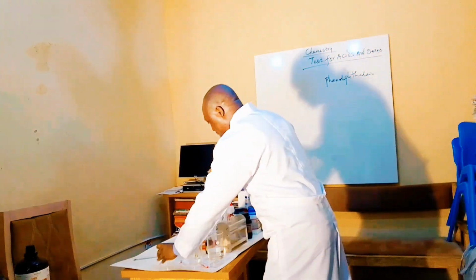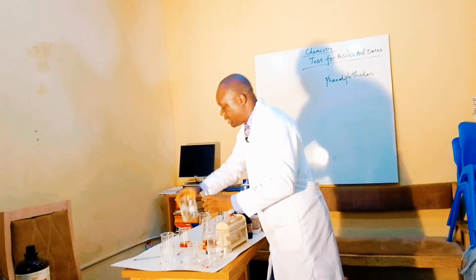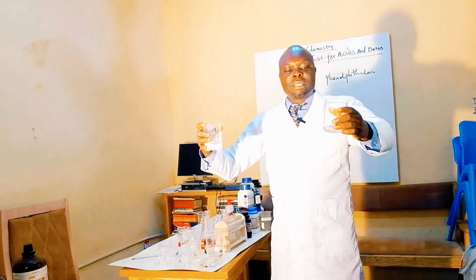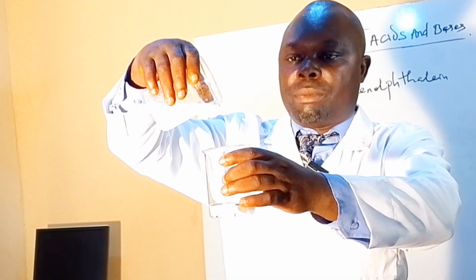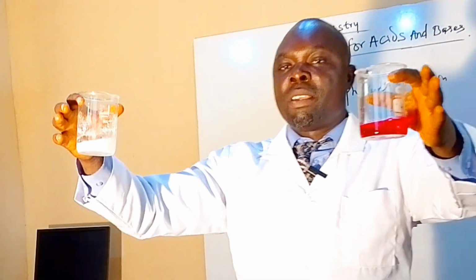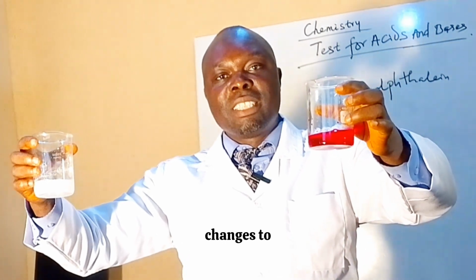But for the base, let's add phenolphthalein to base and see. The phenolphthalein in base changes to pink.